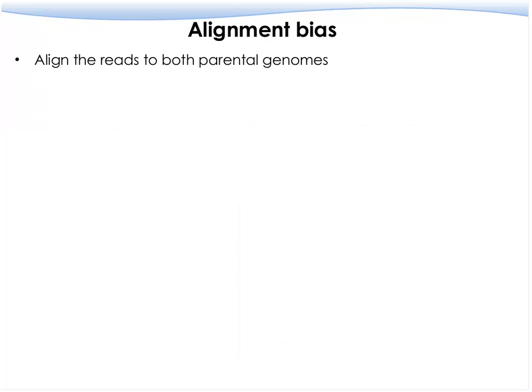And apparently this is only good for animal studies. And we know that for many mouse projects, for example, mouse strains, the parental strains' DNA sequences are available. So if we want to study the allele-specific expression of the F1 offspring, we can really map the sequencing reads back to both parental strains and further consolidate our results. And this will be a very powerful analysis that can almost completely remove the alignment-specific bias.